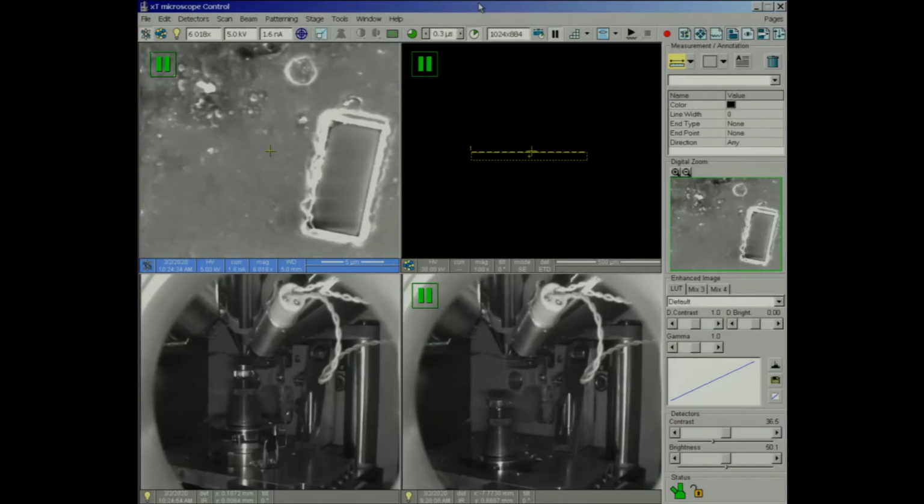One thing that you will sometimes come across, related to the averaging integration issue, is that you'll tell it to unpause, and it will immediately pause again. All this means is that the previous user had set this for a low frame rate integration. Just pull down the menu here, set it to averaging, and you're good to go.